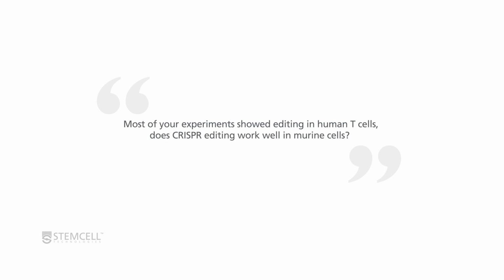The challenge is really in delivering and expressing the CRISPR components in a really effective way. And so in primary murine epithelial cells, I think it's just a matter of trying to optimize the methods of culturing those cells and delivering the CRISPR components. So theoretically, it should work. We don't have a protocol for that, but if there is significant need, we'll try and develop one.